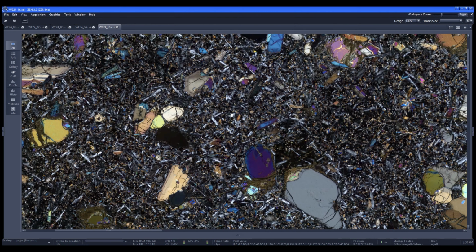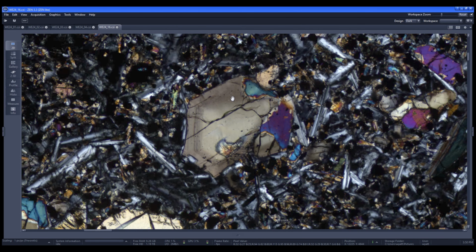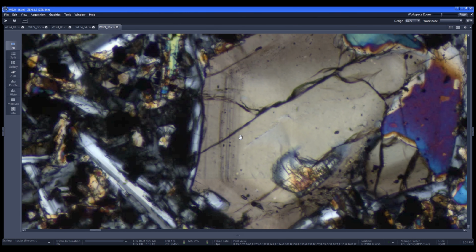It looks like it's been rounded off on its ride up the magma conduit to the surface and eventually dumped into the lava. While a lot of other crystals seem to have survived, like this pyroxene here, you can see its crystal faces pretty well. And this is also another good example of something else I haven't talked about.